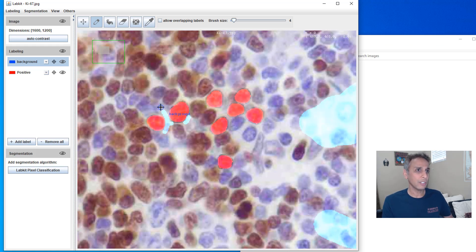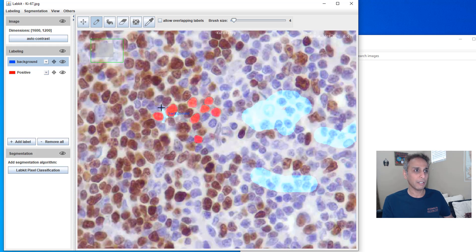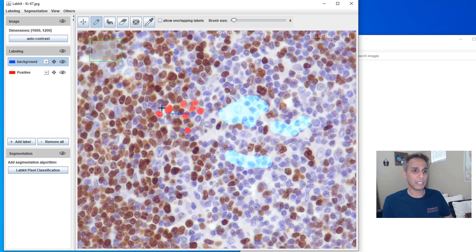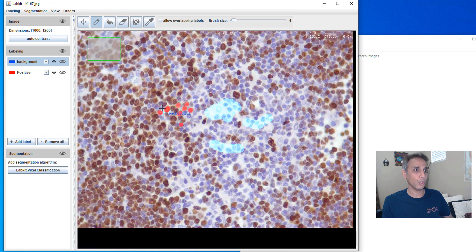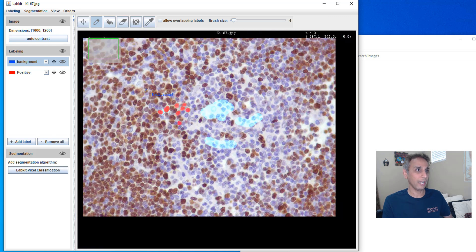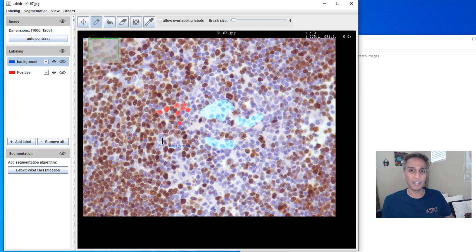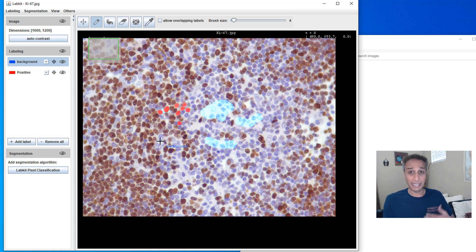And it's also important to draw the boundaries between these so it can get the, you know, so your machine learning learns from these regions. It's very important. So let's go ahead and add a few pixels right here.